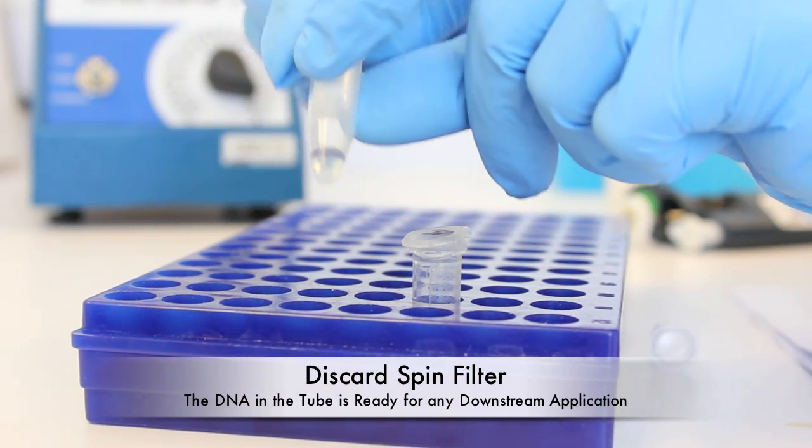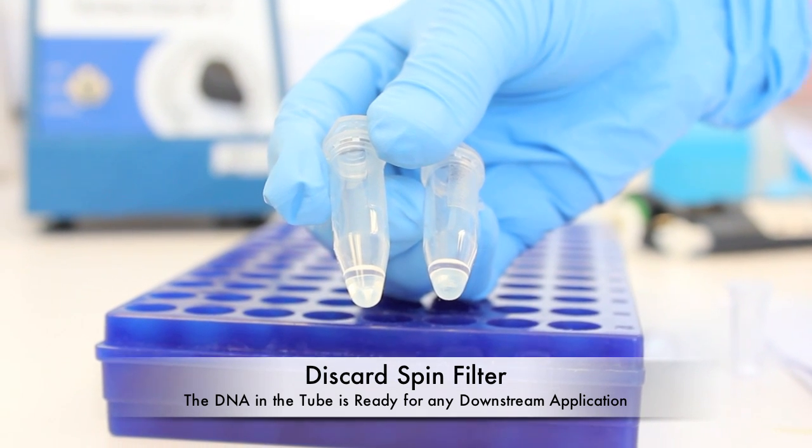Discard the spin filter. The DNA in the tube is now ready for any downstream application.